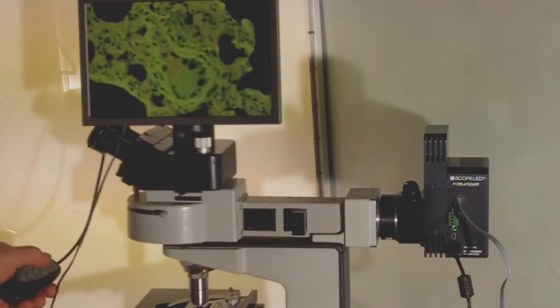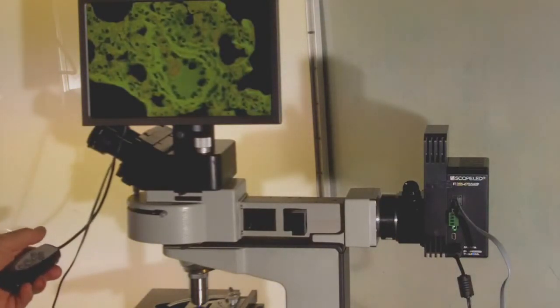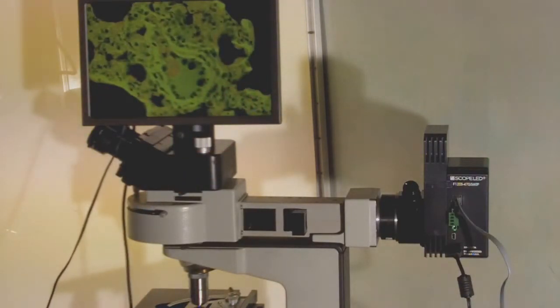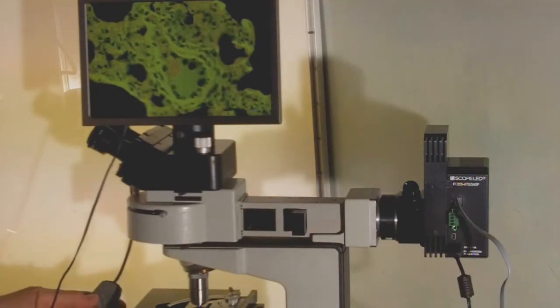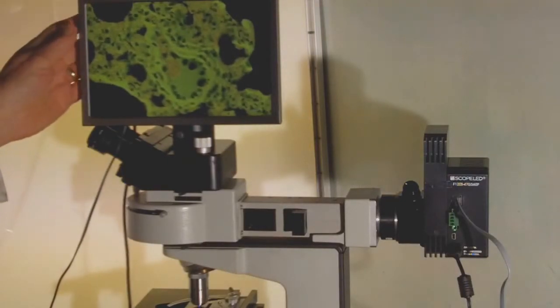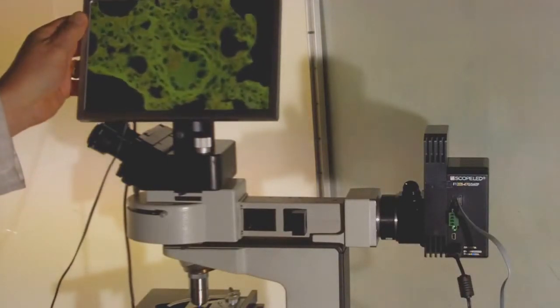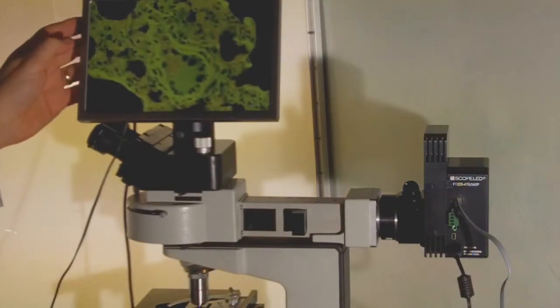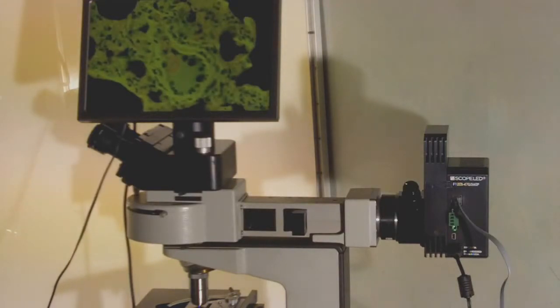It does a really nice job even with dry objectives. This is a fairly run-of-the-mill S-CMOS sensor in this camera, so there's no Peltier cooling going on here. Having the TIF screen makes it nice because we can tilt it at different angles depending on the room light. It's best that you keep the room lights dim when doing any type of fluorescence microscopy.